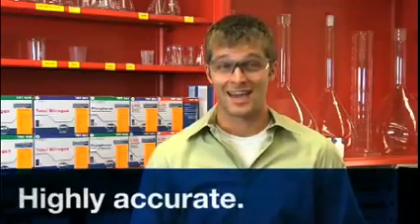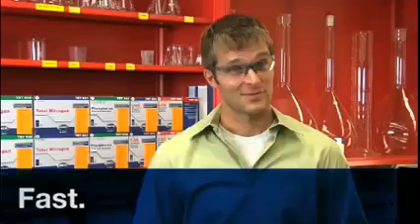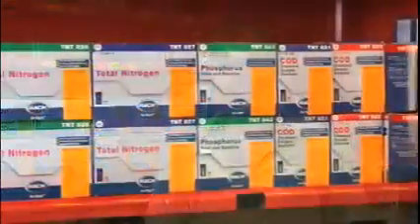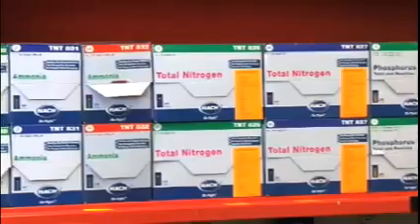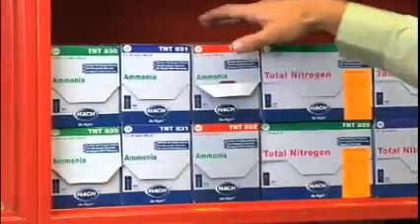Hach's TNT Plus reagents are easy to use, highly accurate, and fast. See for yourself. The TNT Plus system is easy to use for everyone, from seasoned professionals to testing amateurs.